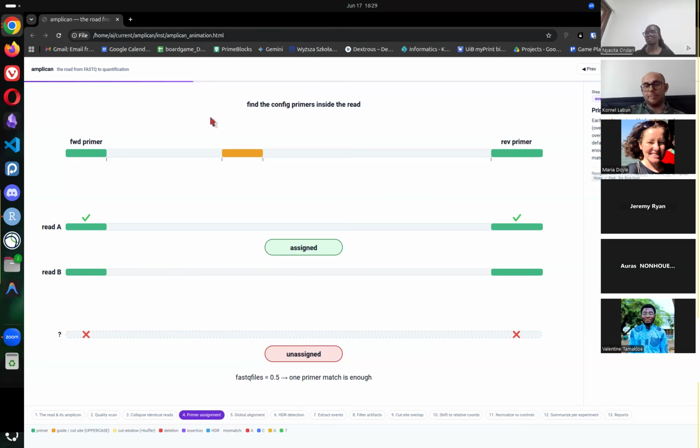Yes. Okay. There's also another question from the pad that's not completed, but the question is, what would you recommend for polyploids in terms of the normalization for control? Yeah, this is tough. If you're running ampliCan, I recommend don't set controls to nothing, so like control column 0. And then in the variant plot, you can see what is going on. And then you need to write a custom script.